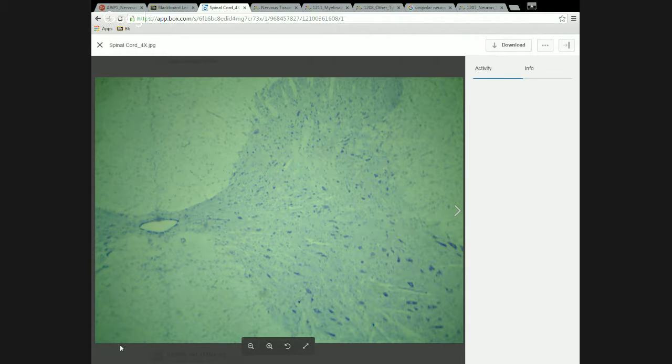The three areas are related to different functions. The ventral horn, which is what we're going to look at, contains neurons that control skeletal muscles. So the ventral horn is full of motor neurons, which we learned about last section in the musculature. The motor unit is comprised of one neuron and all of the muscle fibers it controls. The motor neurons that make up motor units are these neurons that we're going to be looking at here.